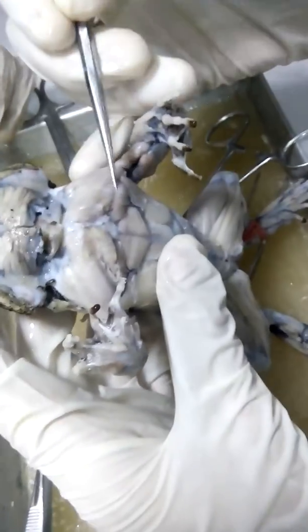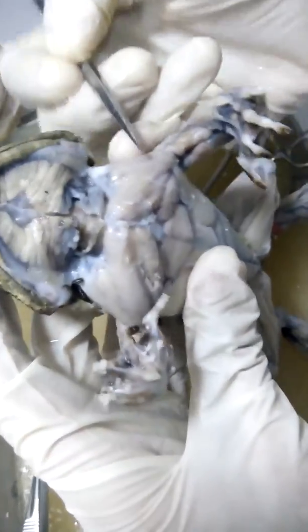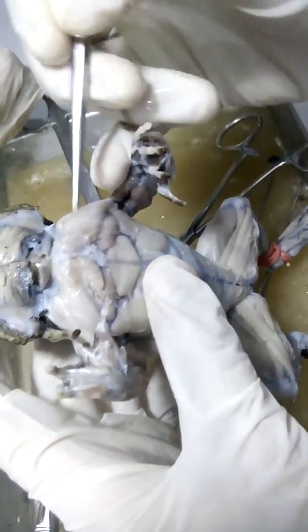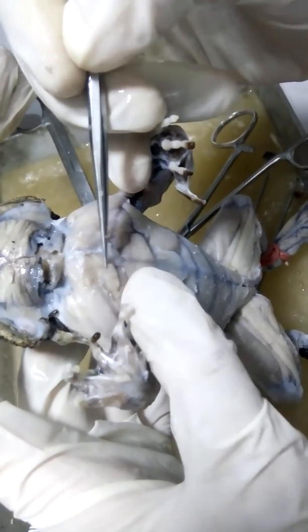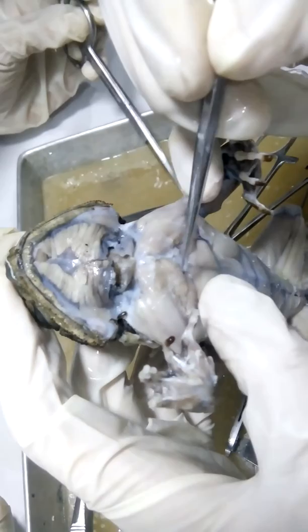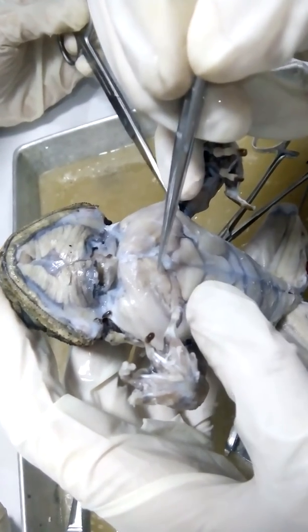Okay. So going down, this very bulky muscle is your deltoid, and just partially covering another muscle called your sternoradialis.